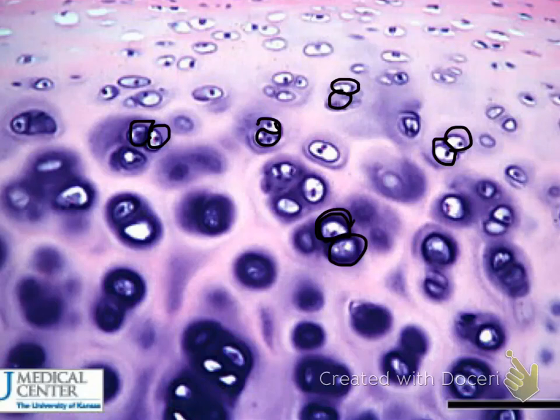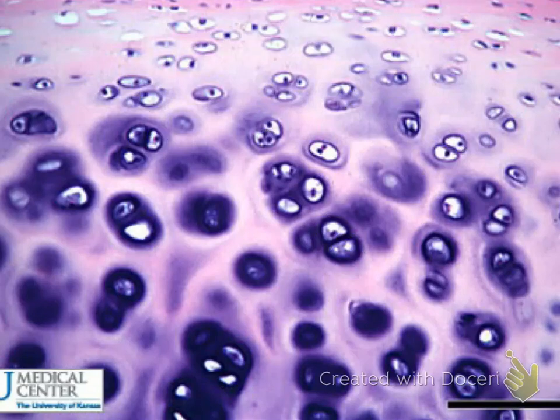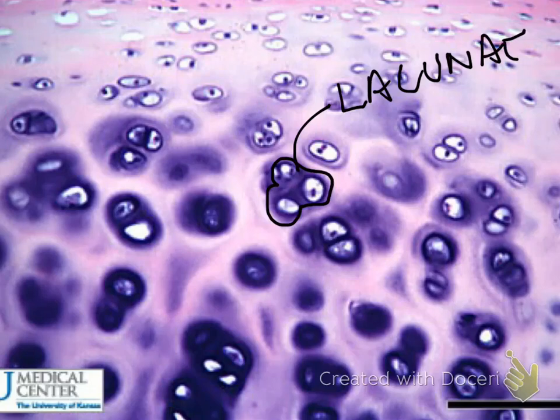The cells found in cartilage tissue are called chondrocytes. The house or the space that they're sitting in — this darker area behind it — is called the lacunae. The chondrocytes live inside the lacunae.